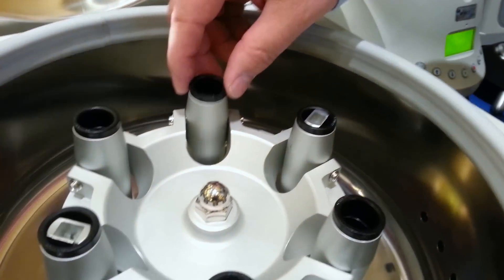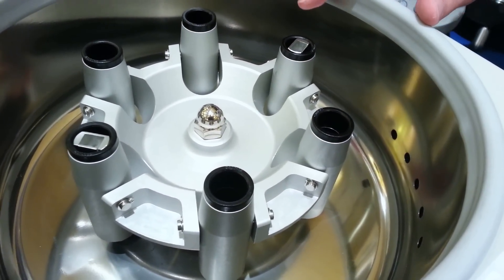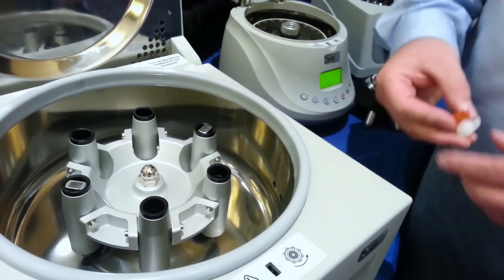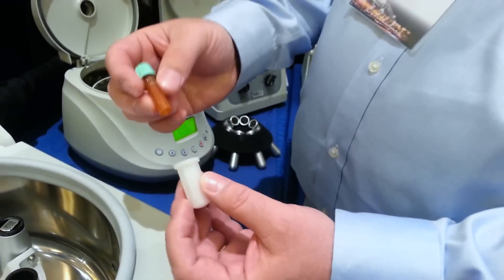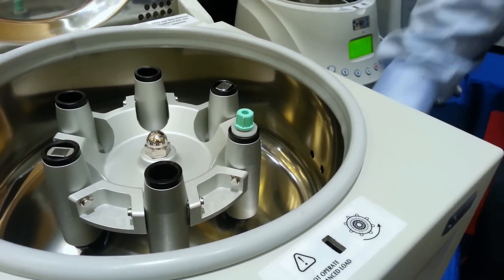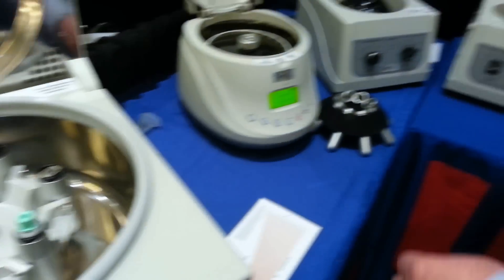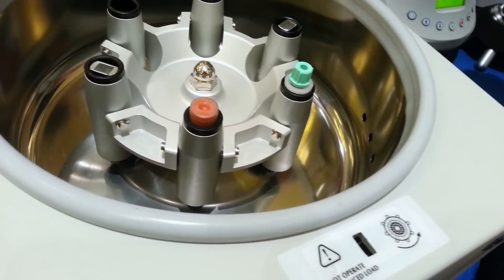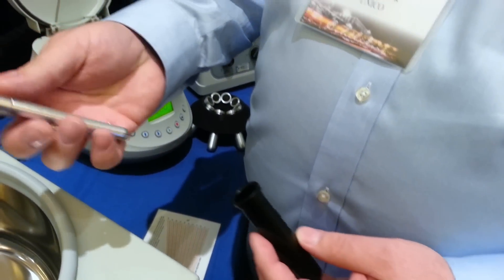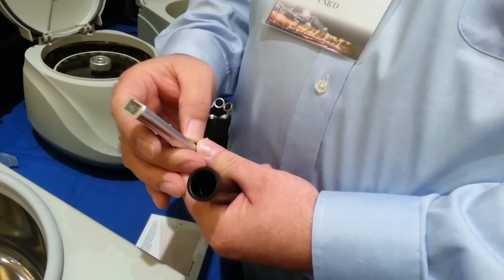If we can look inside the rotor chamber, you'll see that it's six horizontal spin tubes. These are perfect for the fecal protocols that customers are doing, but will also spin just about any size tube. You can see the 2 ml tubes will fit in and can be spun like that. You can use another adapter and spin your short tubes, and you can also spin the long tubes as well. And there's a contraption inside here that also allows you to spin your micro-hematocrit tubes.